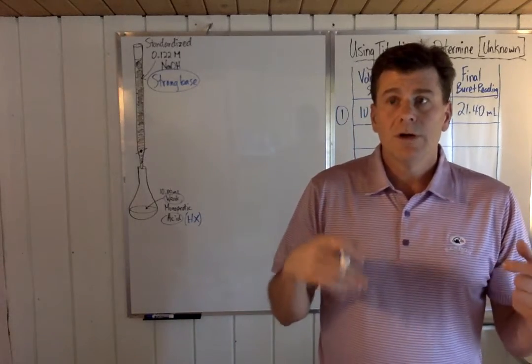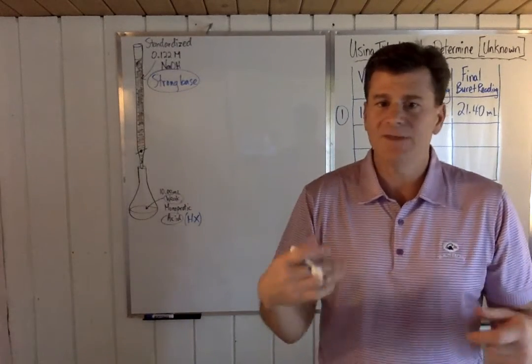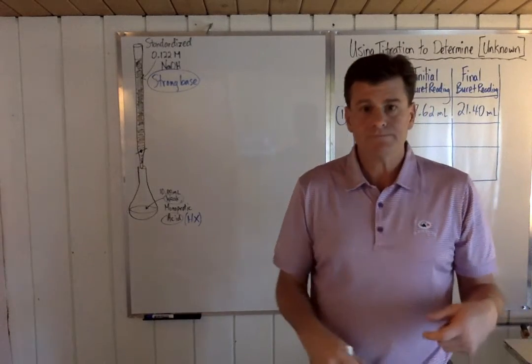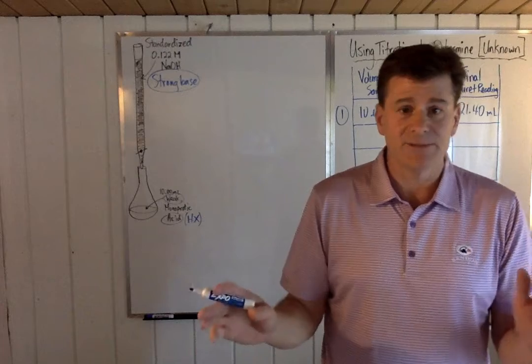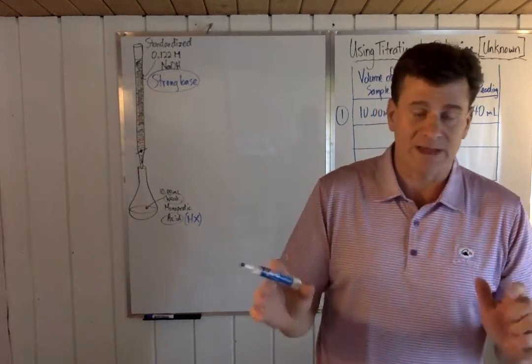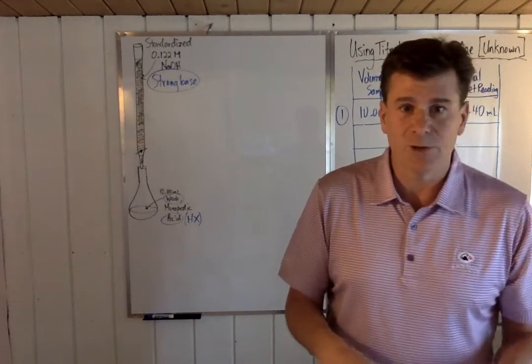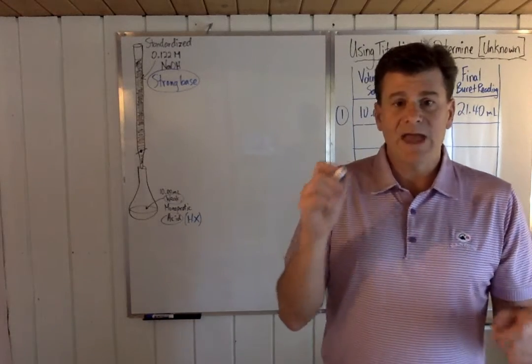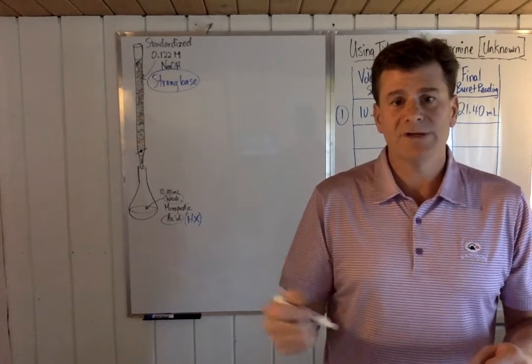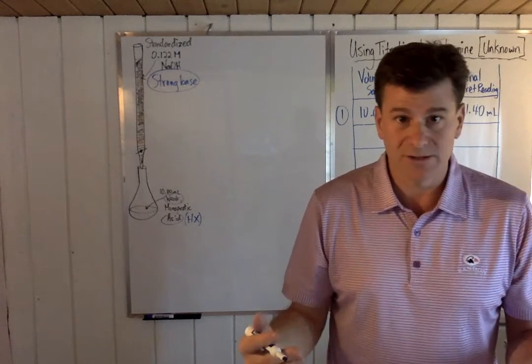So a good trial is going to be defined by what your teacher says. There are actually rules and statistics for outliers, but we're really not getting into statistical significance and how to determine outliers in Chemistry 12. A rule of thumb that I like to use with my Chemistry 12s is, if any value is outside of plus or minus 1% of the average, then you're going to throw it out. It is not a good trial.